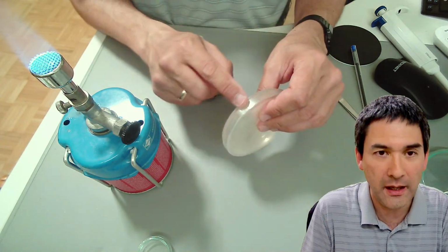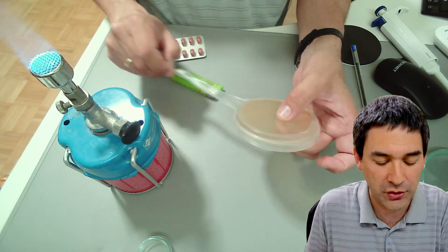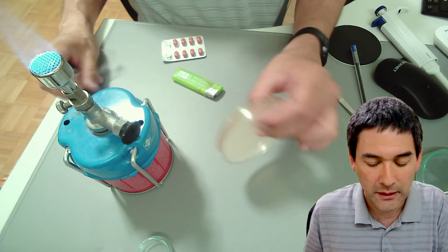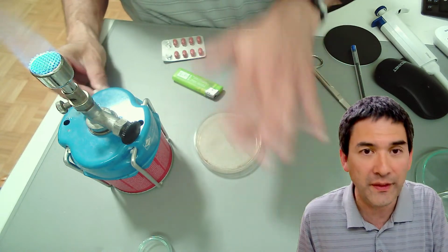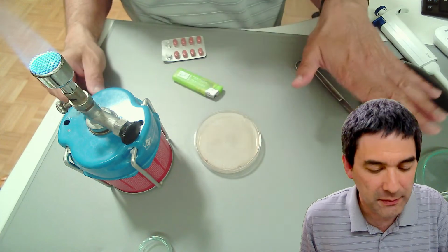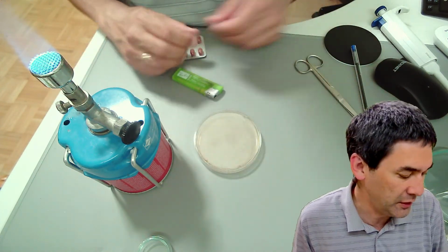Over here, I've wrapped it. I've closed them off using parafilm. I'll show you a little bit later. So I'm going to unpack the thing here. Something I did not show you yet is I have disinfected everything with alcohol. Got to be careful with alcohol and fire, okay? But everything's been disinfected with alcohol, so to make sure that there are no contaminants going in here.